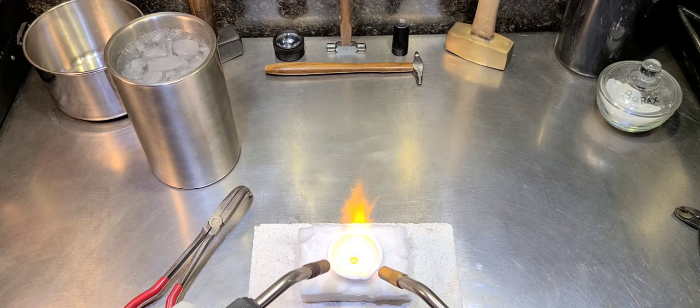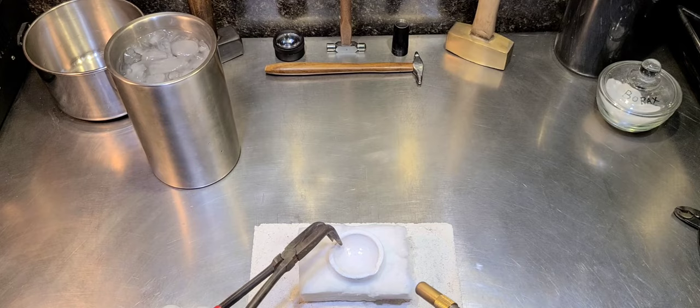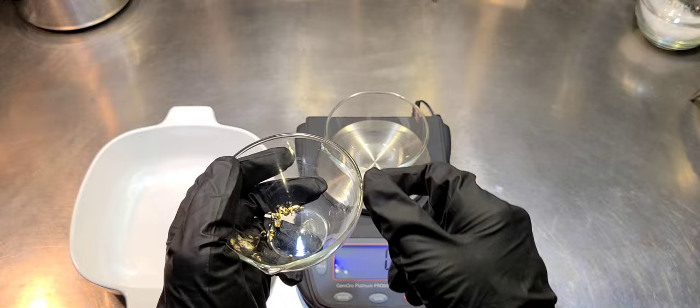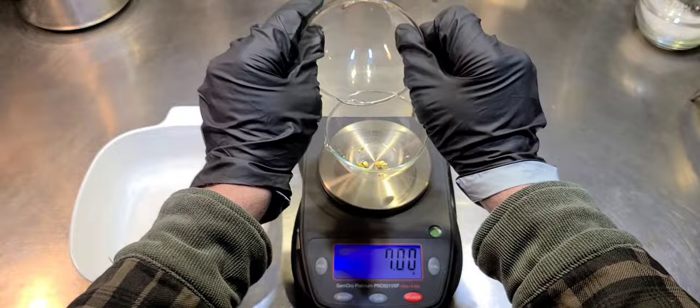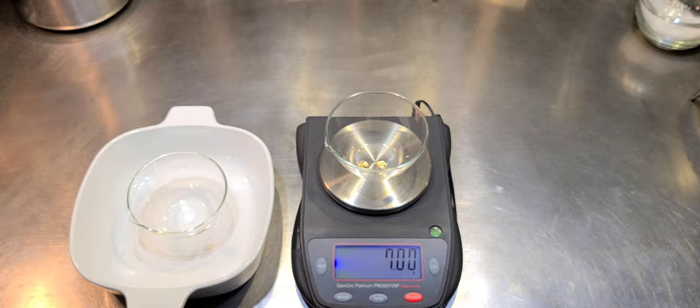Let's melt this gold powder into shot here. We're going to get it melted down and pour it into some cold water to make our shot. That way I have a nice way to store the gold — I don't have to worry about it blowing or knocking around. People ask me all the time why I don't just pour it into a bar, but when I pour stuff into shot it just makes it easier to weigh out the exact amount I need later on. Going from that precipitated gold to the gold shot, we shouldn't have any losses in material here. I did a good job — I didn't leave any in the melt dish.